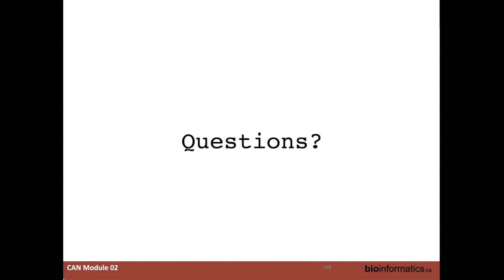If not, you could always go back to them, because this has also happened at one of the production labs that I worked at, where they had to actually process it using the exact same version. And usually that's a discussion point. What version do you want us to use? You have to tell us what program, what version. Those are usually set up in the agreement portion of things. So if you don't set that up originally, get yourself the original raw FASTQs and just do it yourself, assuming you have the computational power to do it. If not, you become a little bit at the mercy of whatever analysis group inside that sequencing center did.